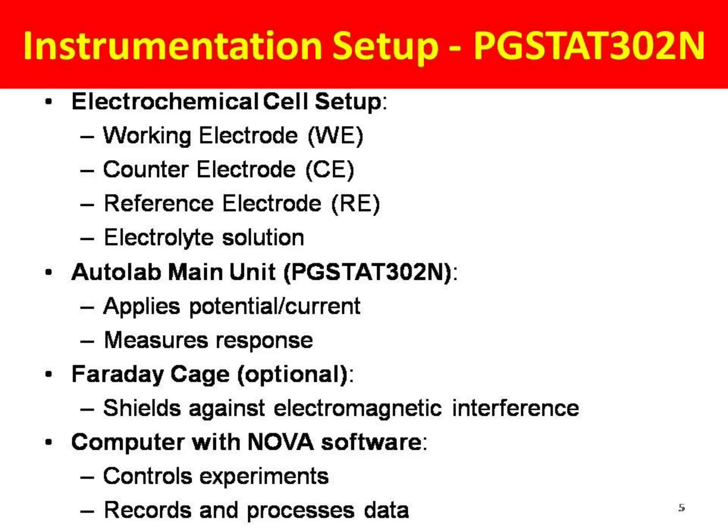The electrochemical setup is a 3 electrode system: working electrode, counter electrode and reference electrode. These electrodes are immersed in a suitable electrolyte. After immersing these 3 electrodes in a suitable electrolyte, you can apply the potential or current and measure the response.